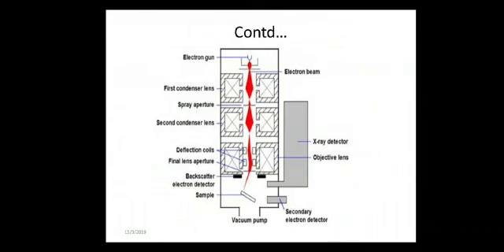Additional sensors detect backscattered electrons, that is, electrons that reflect off the specimen surface, and X-rays, that is, emitted from the specimen surface. You can see the dot by dot process in the red color. So dot by dot or row by row, an image of the original object is scanned onto a monitor for viewing.